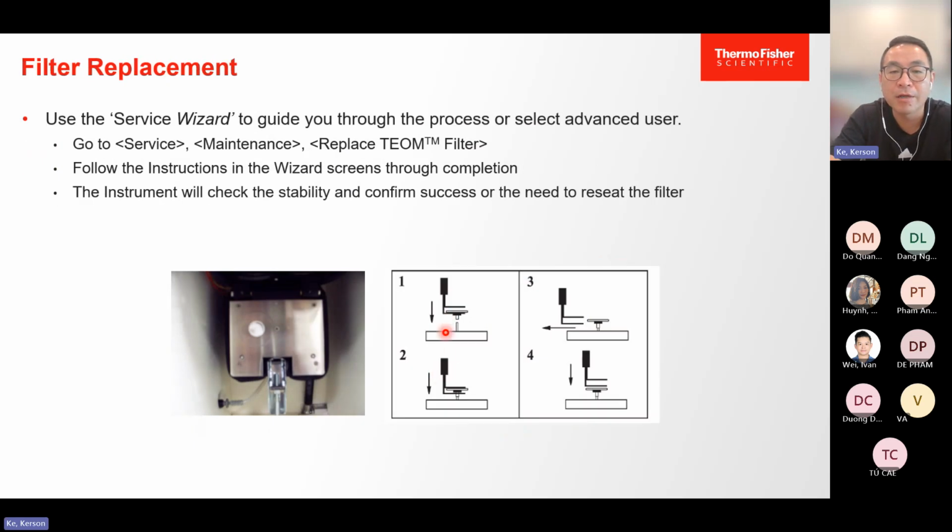We have a tool for this. This is the spare filter. You can use this tool to put the filter on the microbalance.